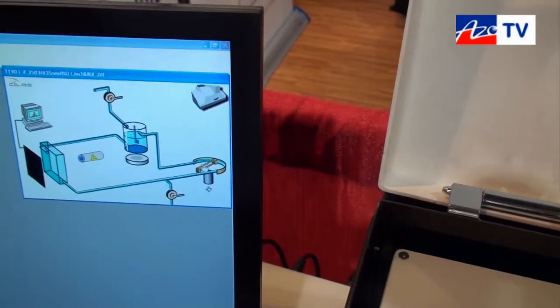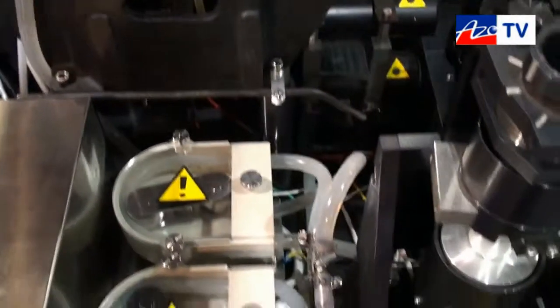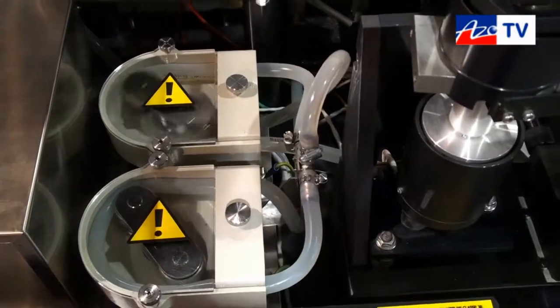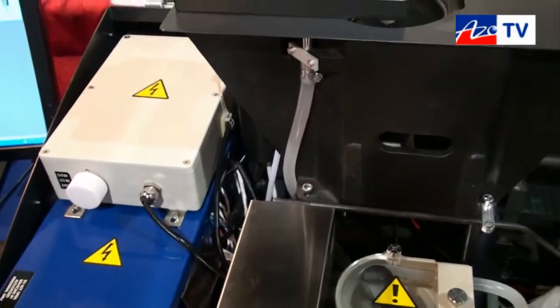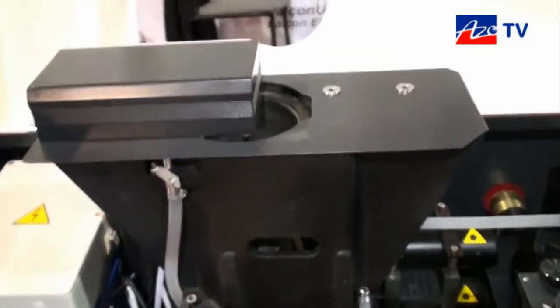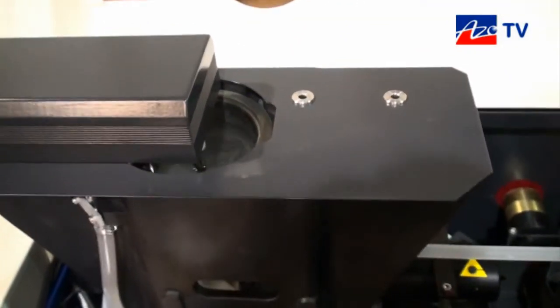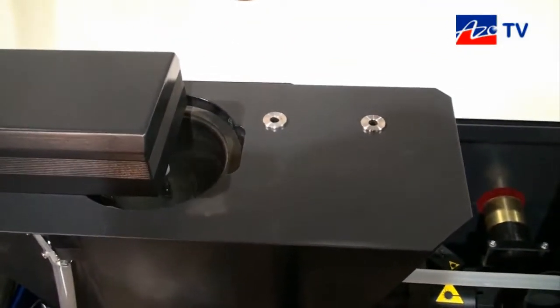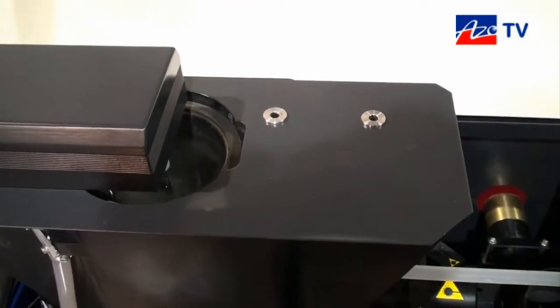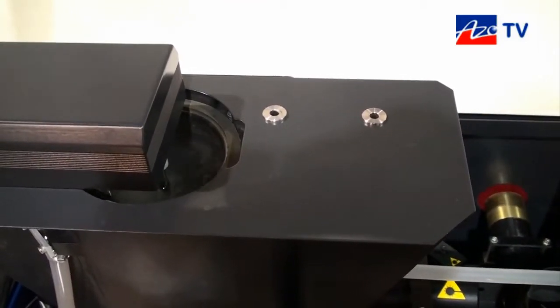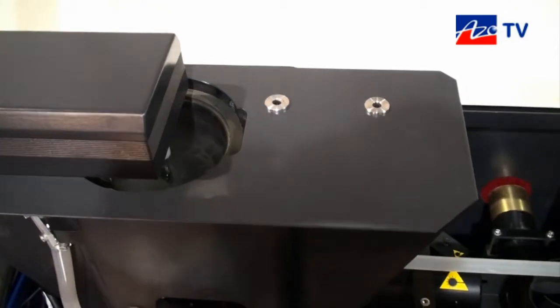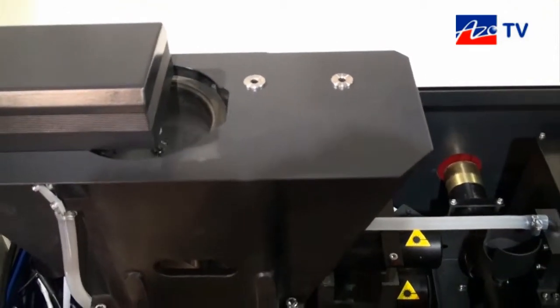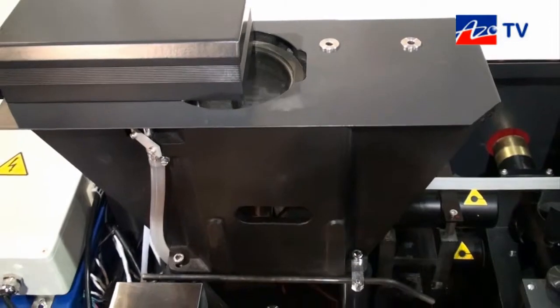We can do the same for ultrasound, for stirring of the actual tank, so whatever's in there, as well as being able to look at the ultrasound using a 50 watt ultrasonic bath, for example, that's in liquid dispersion.